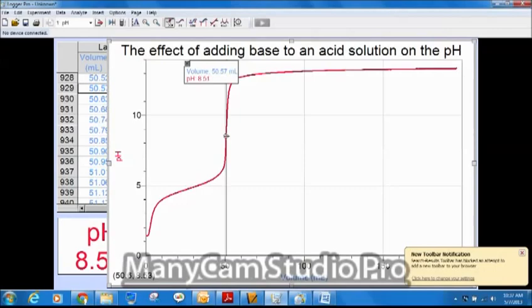What we want to do is identify the best equivalency point on here. Well, there's kind of a long section here that could be the equivalency point. Now, in general terms, you want the steepest place on the curve. But if we're really specific about the steepest place on the curve, we could do a little bit better than just visual examination. Or visibly examining, I might be right about there. That'll talk about the midpoint on the steepest part of that curve. Okay? Now, that's perfectly good, but it's not as specific as we could be.